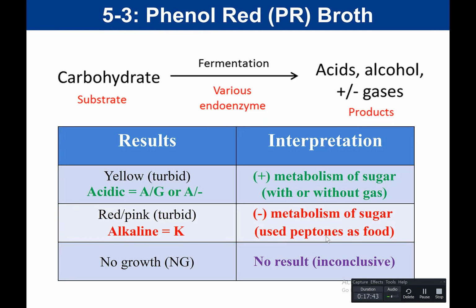You need to know that if you see no growth in this test, the interpretation would be no result or inconclusive. We can't say if the bacteria can metabolize the sugar because it didn't grow. And we can make that assumption because this is complex or undefined media where there are multiple food sources. Bacteria should have been able to use something to grow.